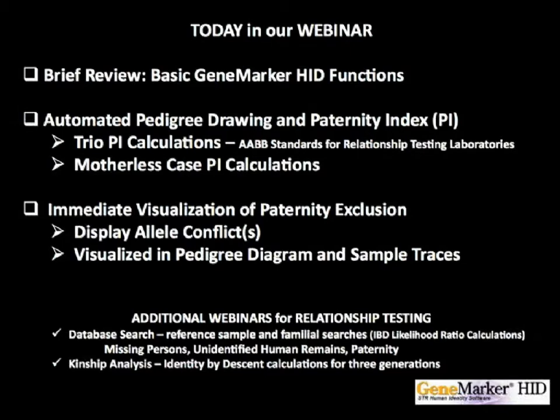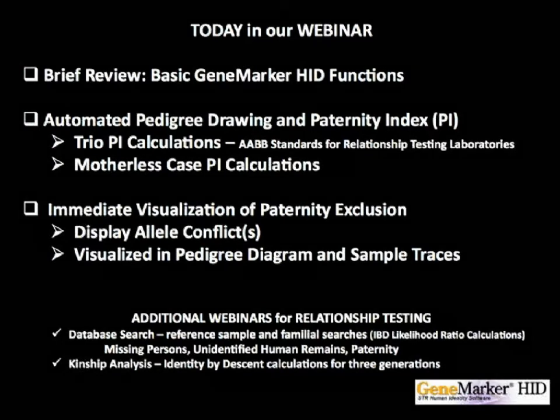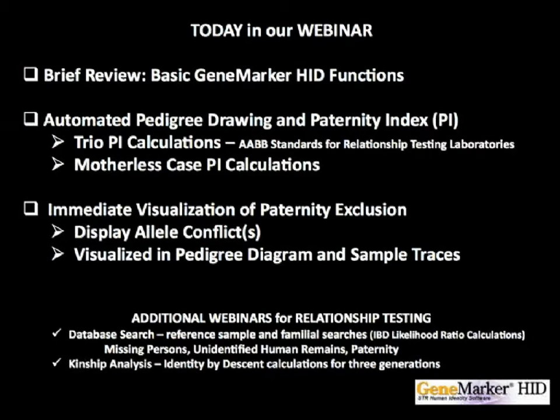The program provides immediate visualization of paternity exclusion or inclusion, displaying allele conflicts in both pedigree diagrams and sample traces. Additional webinars for relationship testing in GeneMarker HID include database searching for reference samples or familial search with likelihood ratios from identity by descent calculations, which are helpful in cases such as missing persons, unidentified human remains, and paternity. There is also kinship analysis, which uses identity by descent calculations across 3 generations.